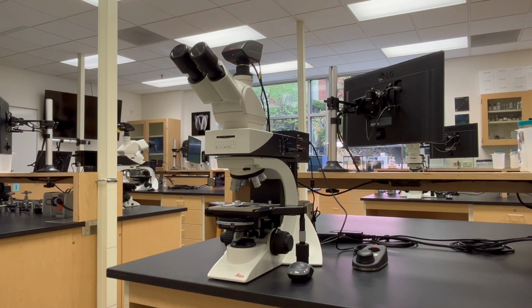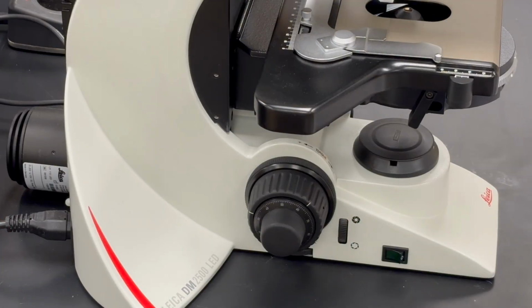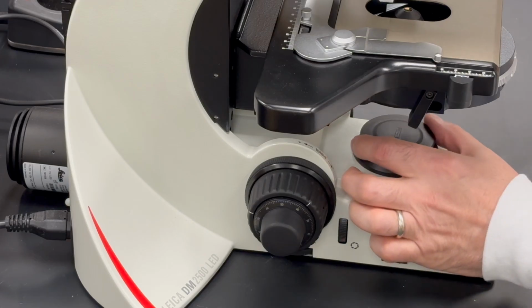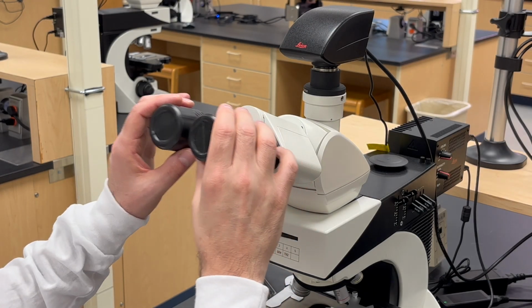If you intend to utilize a mode of microscopy that requires transmitted light, such as bright field, dark field, or phase contrast microscopy, begin by turning on the power for the transmitted light source at the base of the microscope. Remove the protective plastic caps over the field diaphragm lens and the ocular lenses and place them on top of the microscope.